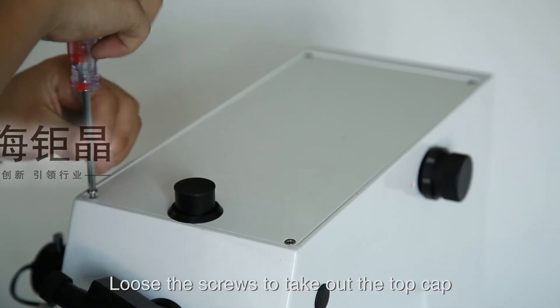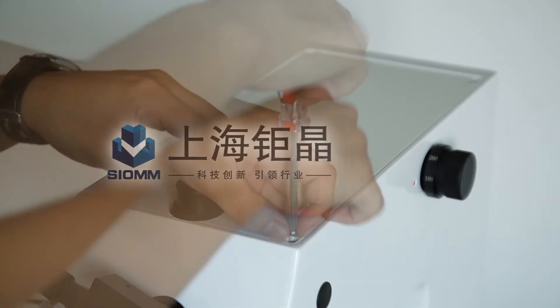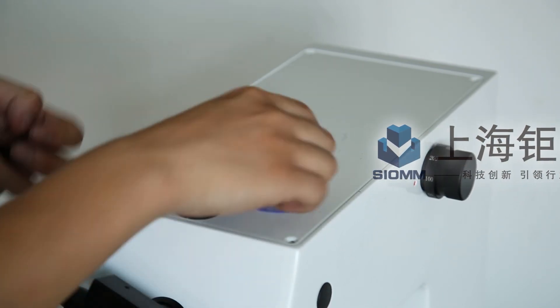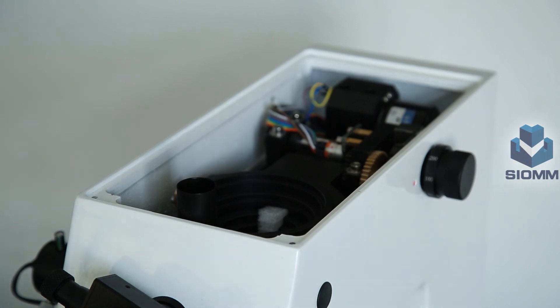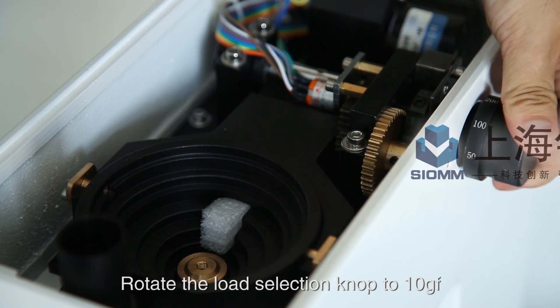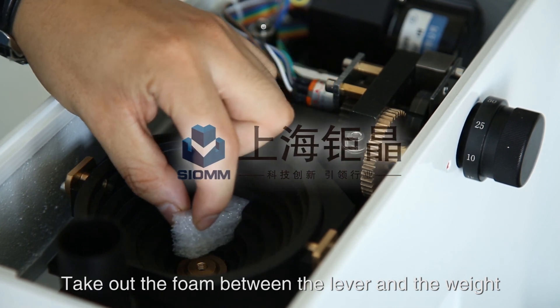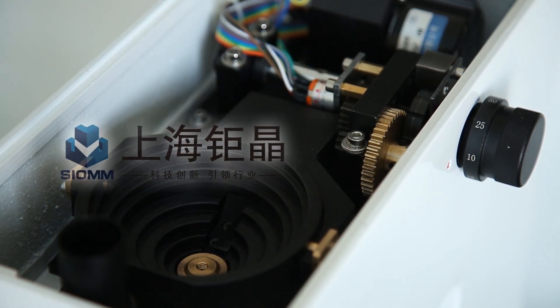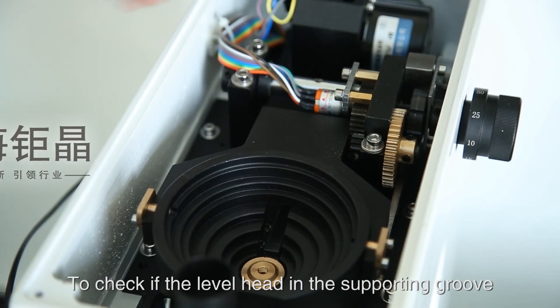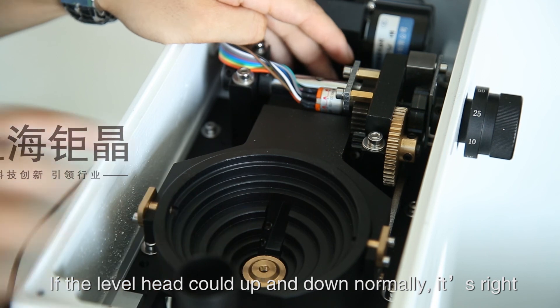Loosen the screws to take out the top cap. Rotate the load selection knob to 10g. Take out the foam between the lever and the weight. Rotate the load selection knob to 10g and check if the lever head is in the supporting groove by pressing here gently. If the lever head can move up and down normally, it is correct.